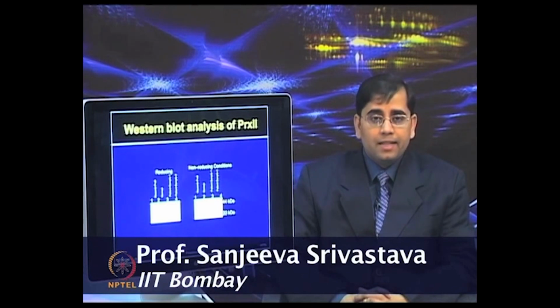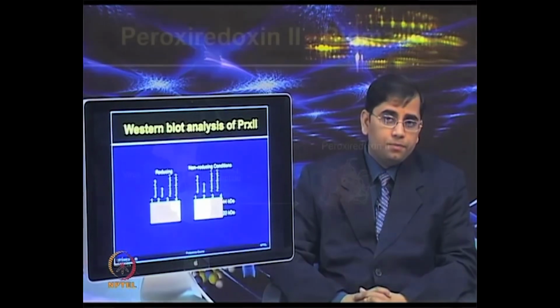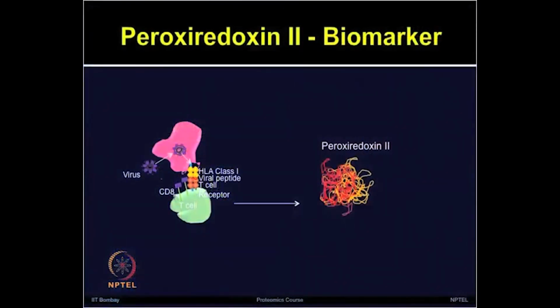These results demonstrated that 4 out of 20 SARS probable cases and 4 of the 20 SARS suspected cases showed higher upregulation of plasma peroxiredoxin 2. Among the various proteins identified from this study, peroxiredoxin 2 appeared quite interesting, also because it was validated by independent techniques.